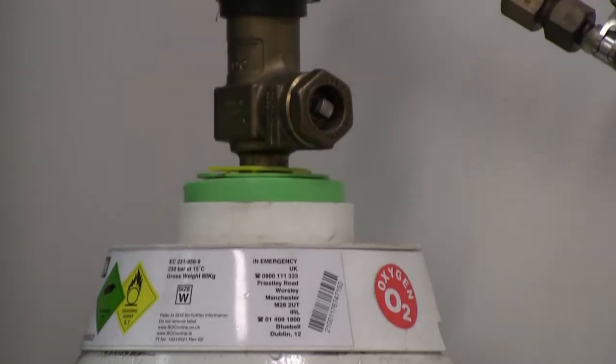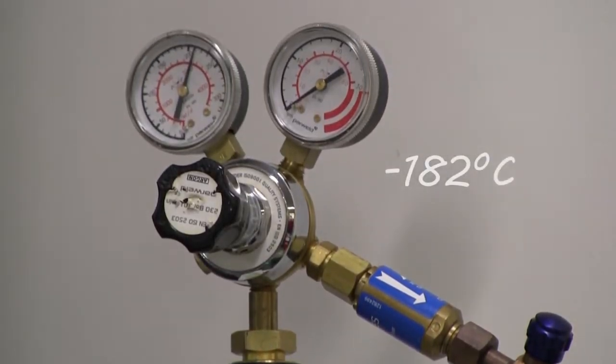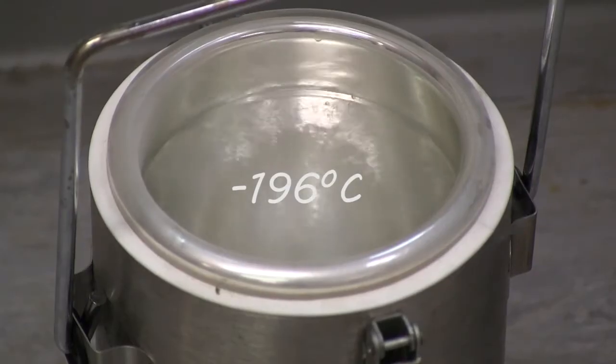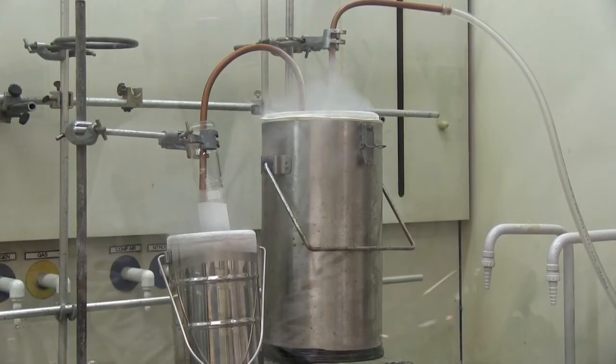First we have to make the liquid oxygen. We have here a tank of pressurised oxygen gas. This condenses at minus 182 degrees Celsius. By passing it through this copper coil, immersed in liquid nitrogen at minus 196 degrees Celsius, the oxygen will condense into a liquid which we will collect in a tube.